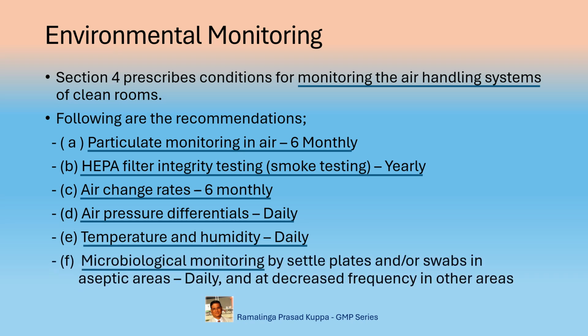Microbiological monitoring by settle plates and/or swab in aseptic areas daily, and at decreased frequency in other areas. Bioburden monitoring will evaluate the presence of microorganisms in the sterile area. Monitoring of bioburden will be less stringent in supporting areas and more stringent in core areas.